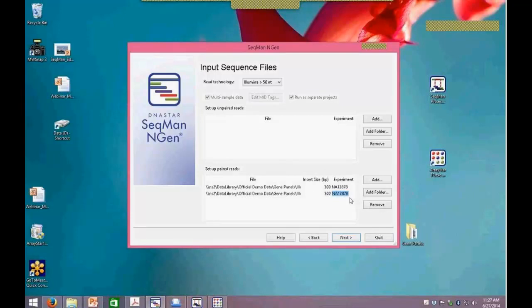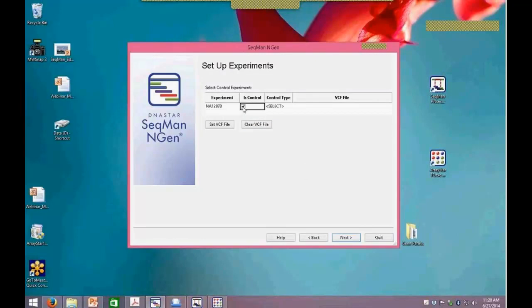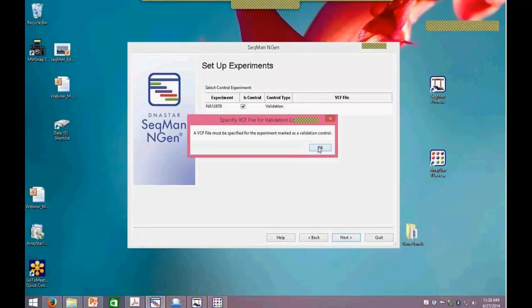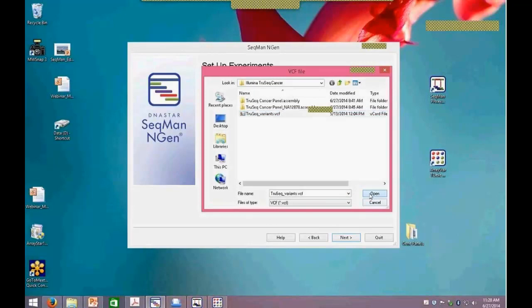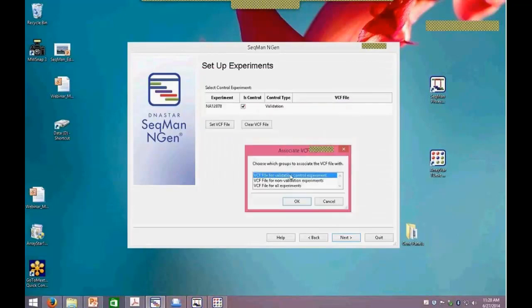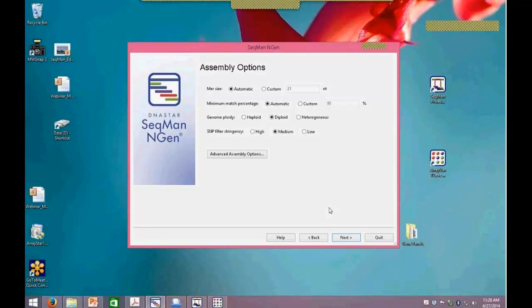When I load the data in, I need to name the data so the software knows how to group them together. Right now I've set up NA12878 as my validation control. There's a new screen for setting up the experiment — it asks me to specify which data set is the control, what type of control, and what list of known variations to associate with the control. I select it as the control, set the type to validation, and then must load a VCF file — it won't let me proceed without one. That's a new screen added to support the idea of having controls.